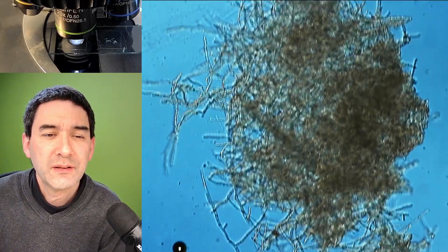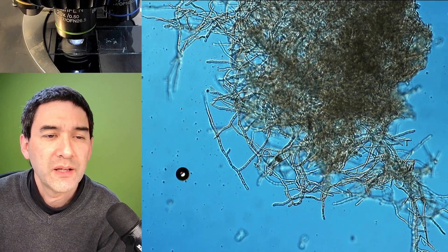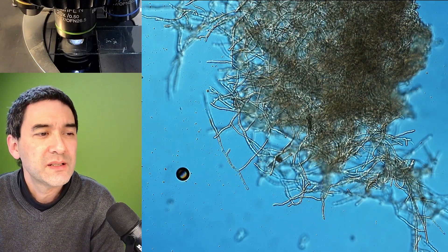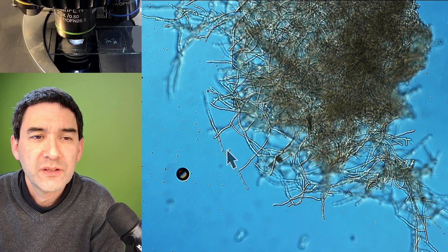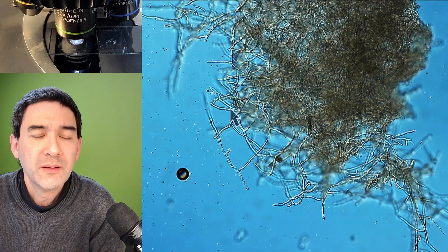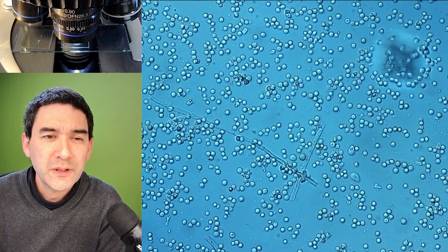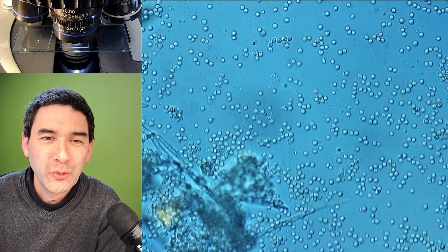You can see that there seem to be fewer spores on here — at least I cannot find any right now. But also very typical for fungus is that it starts to branch. If you look at the individual hyphae — these are the cells here — you see that they are branched, and it's very typical of a fungus. Maybe I'll be able to find a couple of spores from the one before. Plenty of spores, each one capable of starting a completely new fungal colony.